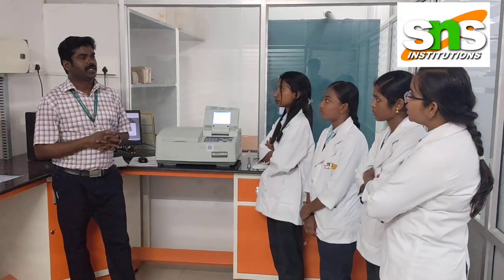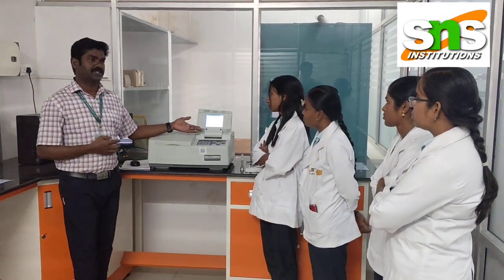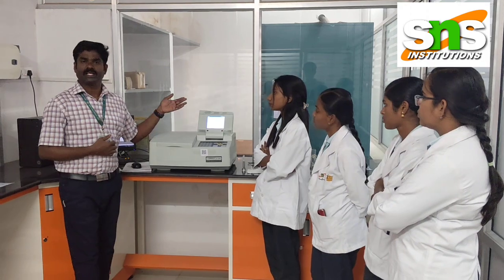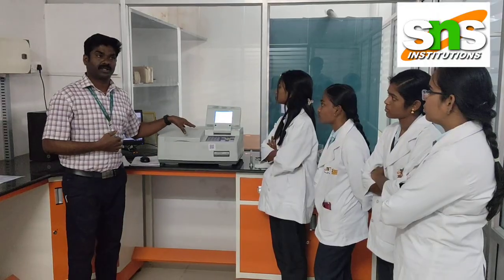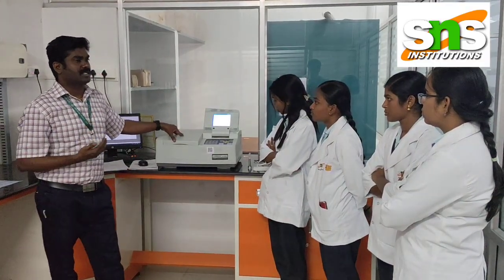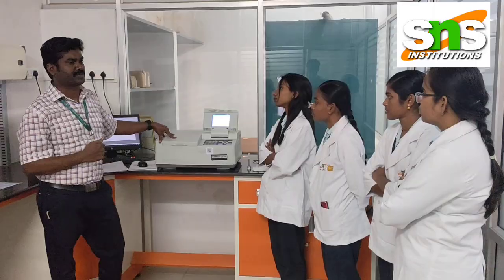What are the major parts of UV visible spectroscopy? Here we can say the sample cell and the source of UV. The source of UV is a major compartment, where different types of lamps are used. Next is the sample cell, and along with the sample cell, before and after it, we use different kinds of filters. Then detectors, and the amplification and data output. These are the major components of UV visible spectroscopy.